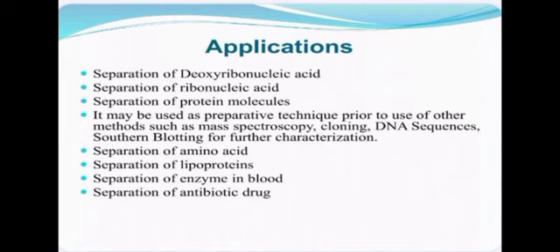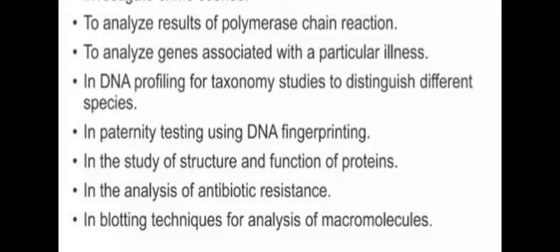And next, the separations of amino acids. It is used to separate the lipoprotein. It is used to separate enzymes in blood. It is used for separations of antibiotic drugs. Next, to analyze results of polymerase chain reaction.